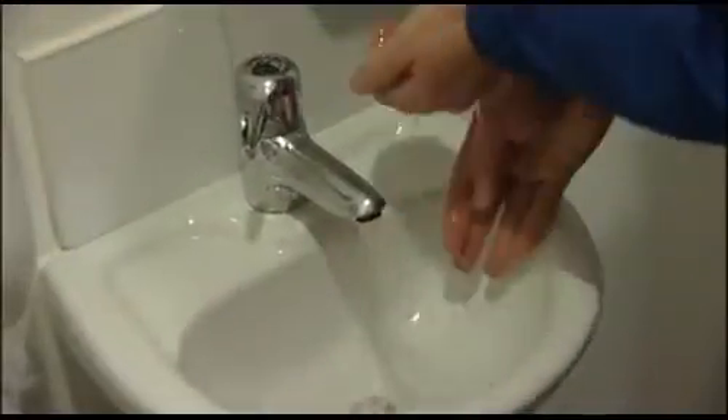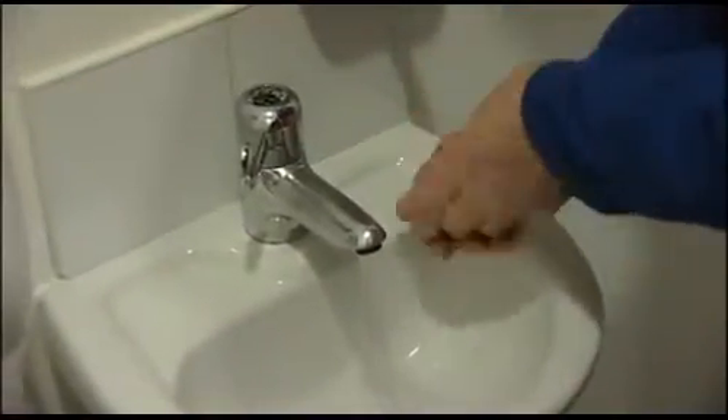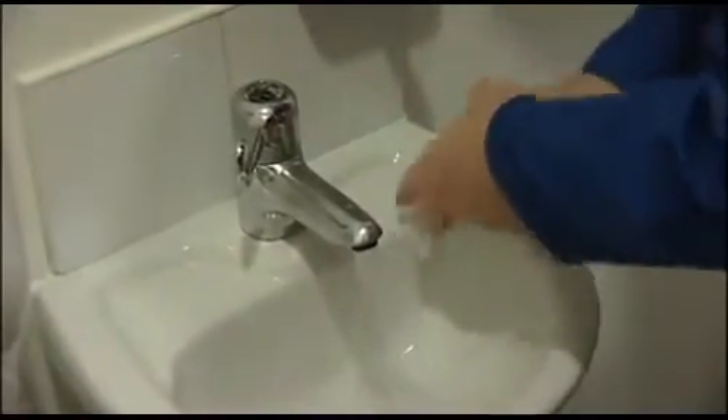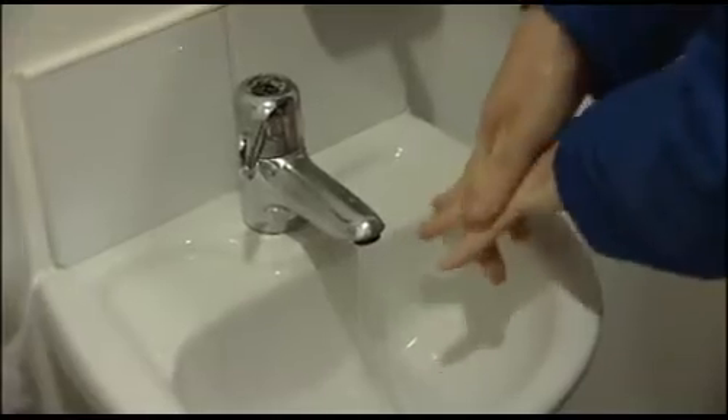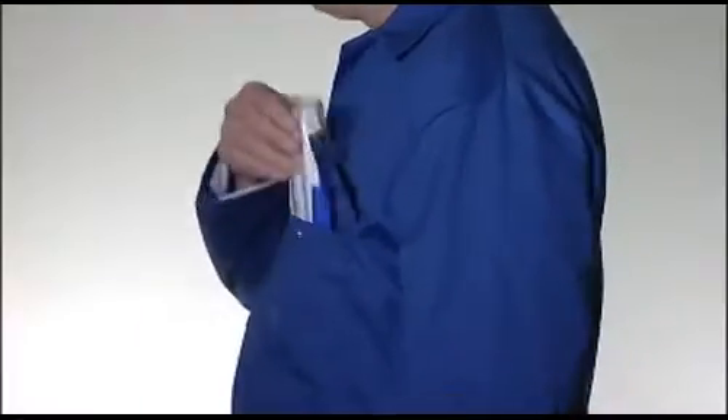Always ensure that your hands are clean when fitting a respirator. This helps avoid skin irritation that can be caused if the inside surfaces of the respirator become contaminated. Check the expiry date on the box has not passed. Familiarize yourself with the user instructions before attempting to fit the respirator.